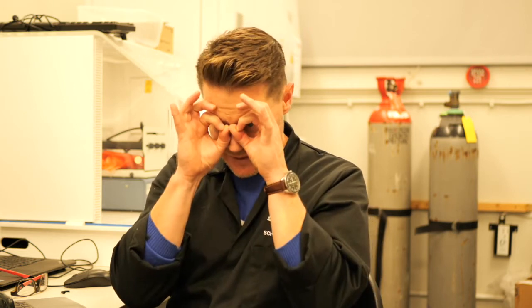Then that light interacts with your sample in some way, typically either transmits through the sample or it is reflected back off the sample to an objective lens, and that objective lens refocuses it back to your eyepiece, and the eyepiece is what you look through to image the sample. I should also say here that if you're using a light microscope, you can look at the sample through the eyepiece, and that's fine. If you're using an electron microscope, you're not going to use a conventional eyepiece because you don't want the electrons bombarding your eyes. You'll be blinded. And so they have a different way of visualising the sample, which we'll look at in a moment. You're probably most familiar with a light microscope, so that's the one that we're going to look at first.